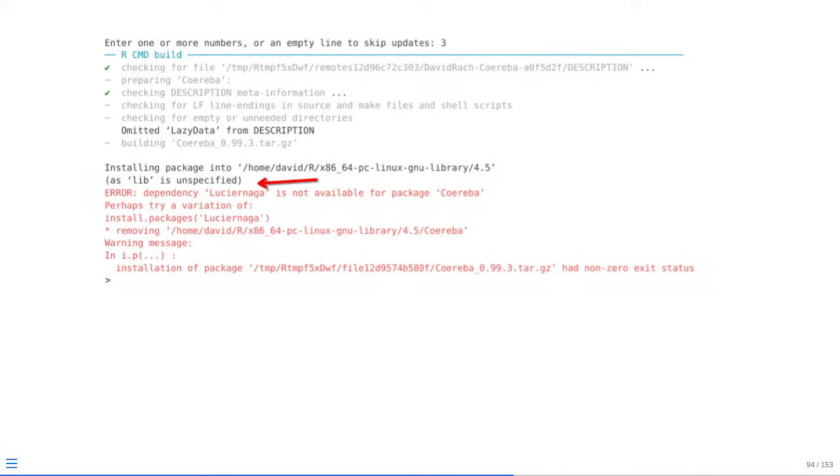If you see an error, often the first thing you do is look through the sprawl of text that pops up in the console and try to spot that little error sign. That's the first cue to focus your attention down here. In this case, I installed one of my packages from GitHub, and then I removed one of the dependencies that was needed for it.